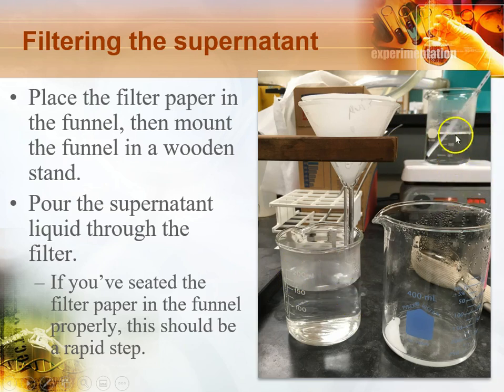Over here I have a hot plate, and you can see that I'm warming up some water, and I did actually measure the temperature to make sure that I heated the water up to about 90 degrees. I didn't want to boil it, but I wanted it to be nice and warm.